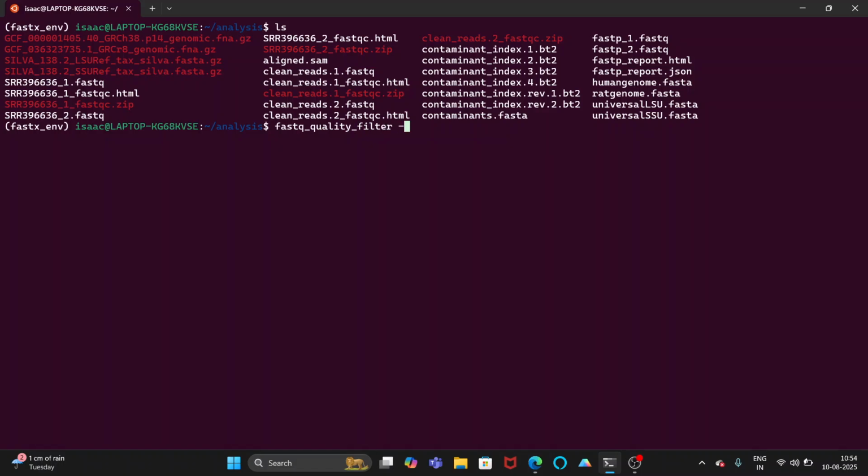Okay. Then there is an option called -q. What -q does is that it marks a base that is present within a read based on the information we provide. As you know, in the fastq format, the quality is basically provided there, and it is denoted in a Phred Q format. There are qualities that are coming up around 10, 20, 30, 40. Most of the qualities that are below 20, or 15, are considered to be problematic. We need to remove them.